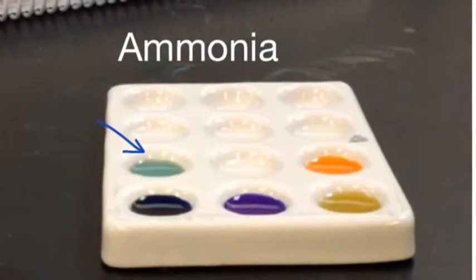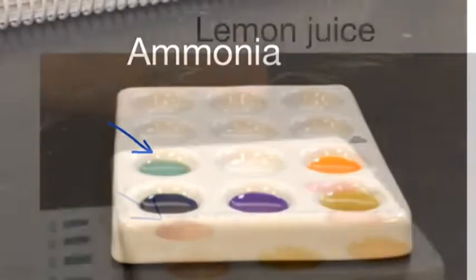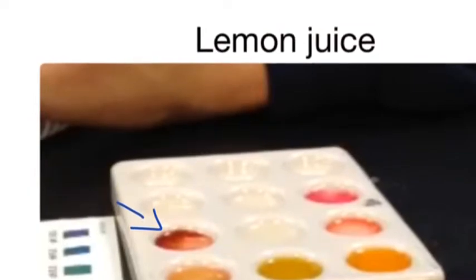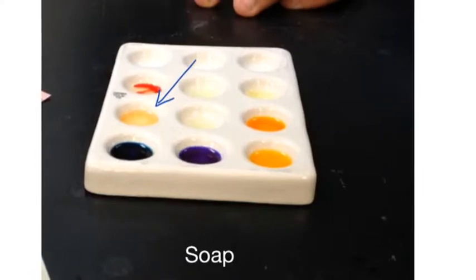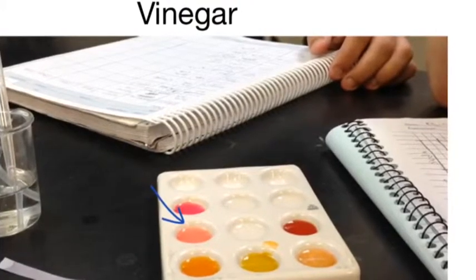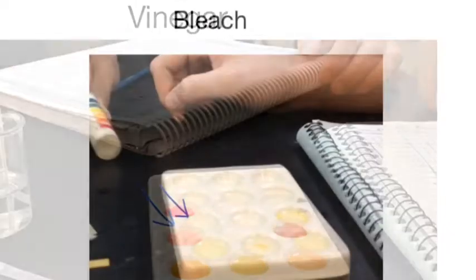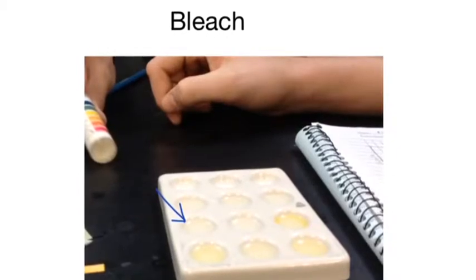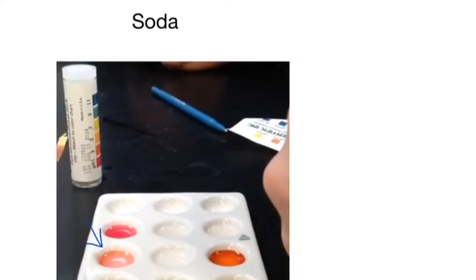When we put 1 drop of universal indicator into the ammonia, it turned light teal, showing that it was a base. When we put 1 drop of universal indicator into the lemon juice, it turned light red, showing that it was an acid. When we put 1 drop of universal indicator into the soap, it turned orange, and it showed us that it was an acid as well. When we put the universal indicator into the vinegar, it turned a pinkish reddish color, showing that it was also an acid. When we put the universal indicator into the bleach, it turned a kind of light green, showing that it was a base. And when we put the universal indicator into the soda, it turned red, showing that it was also an acid.